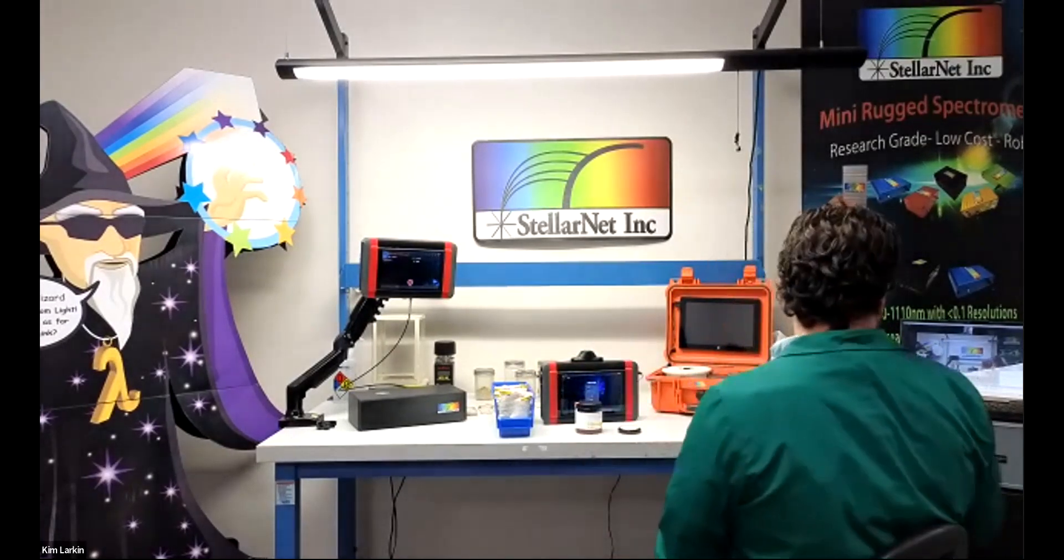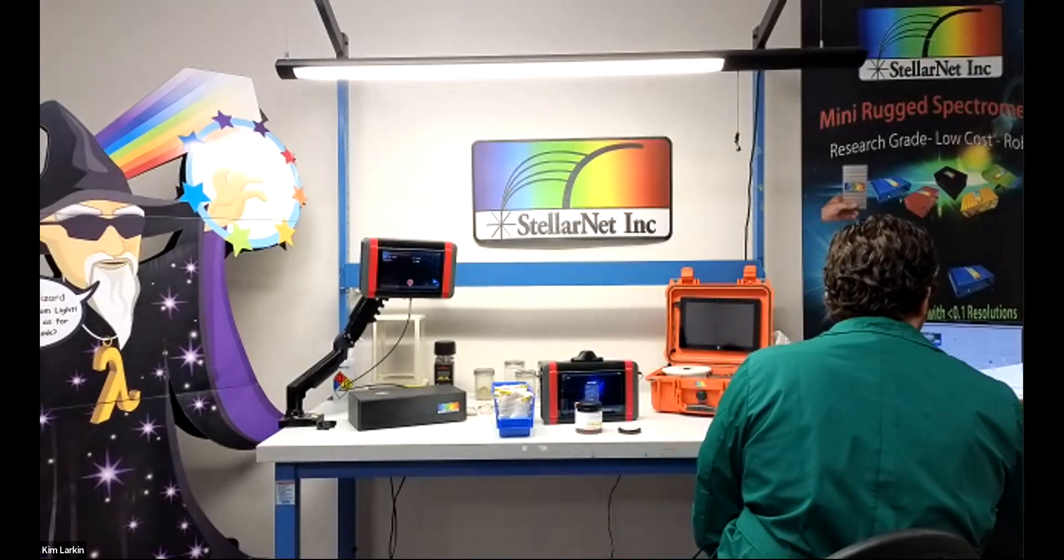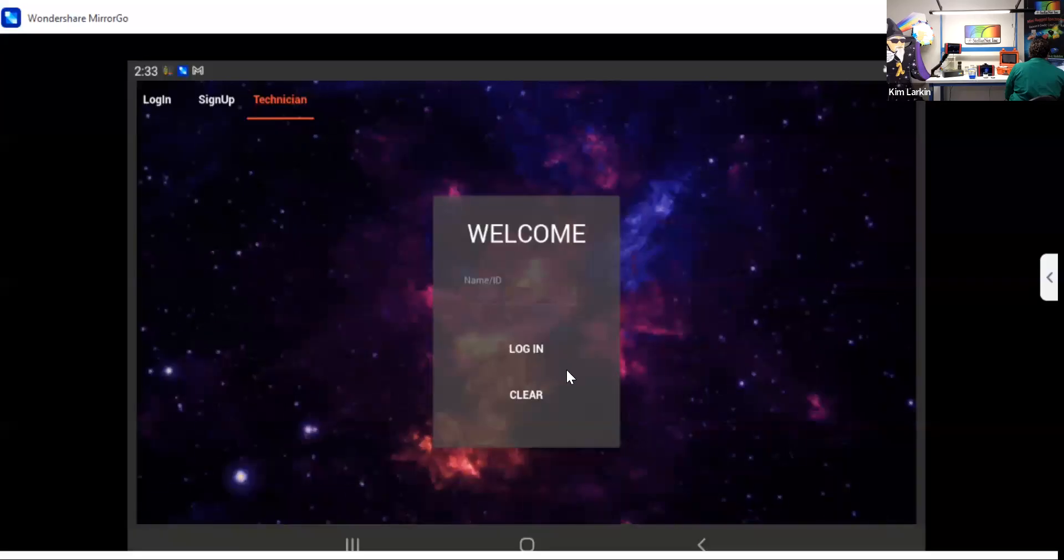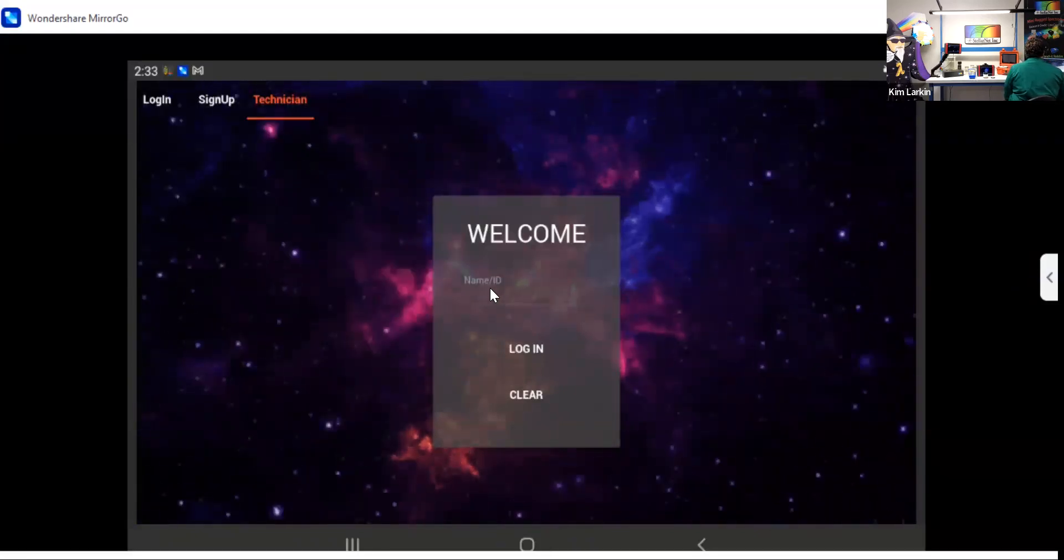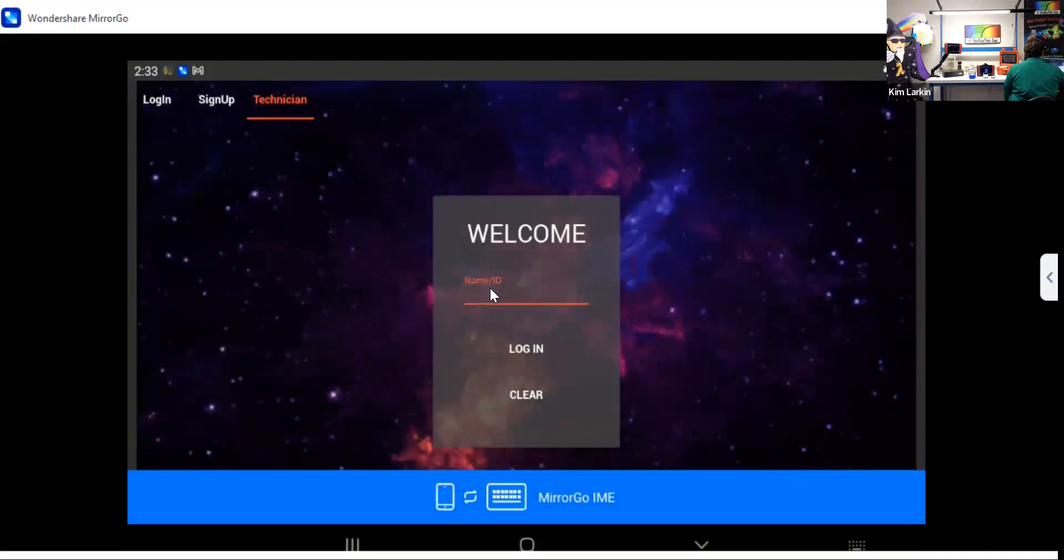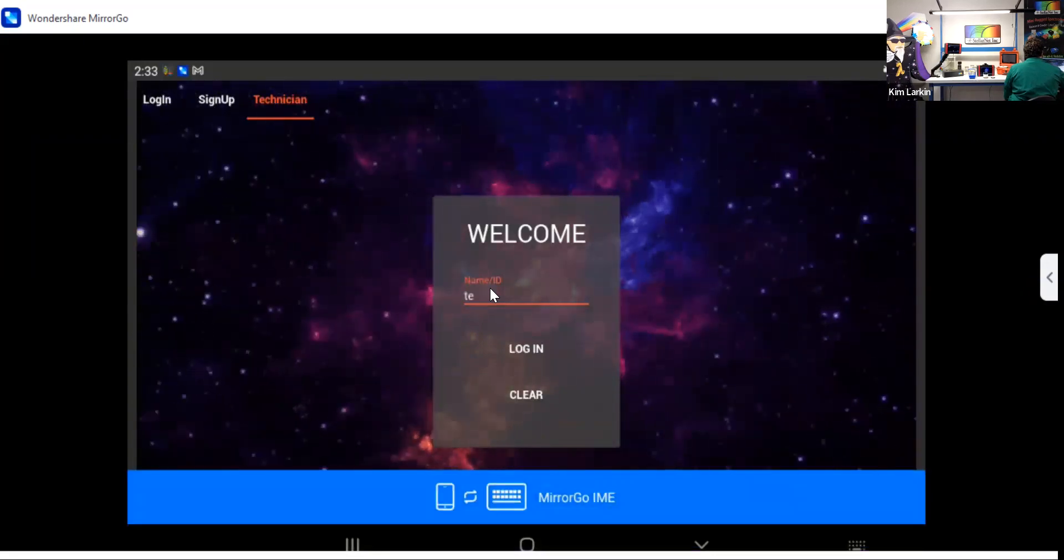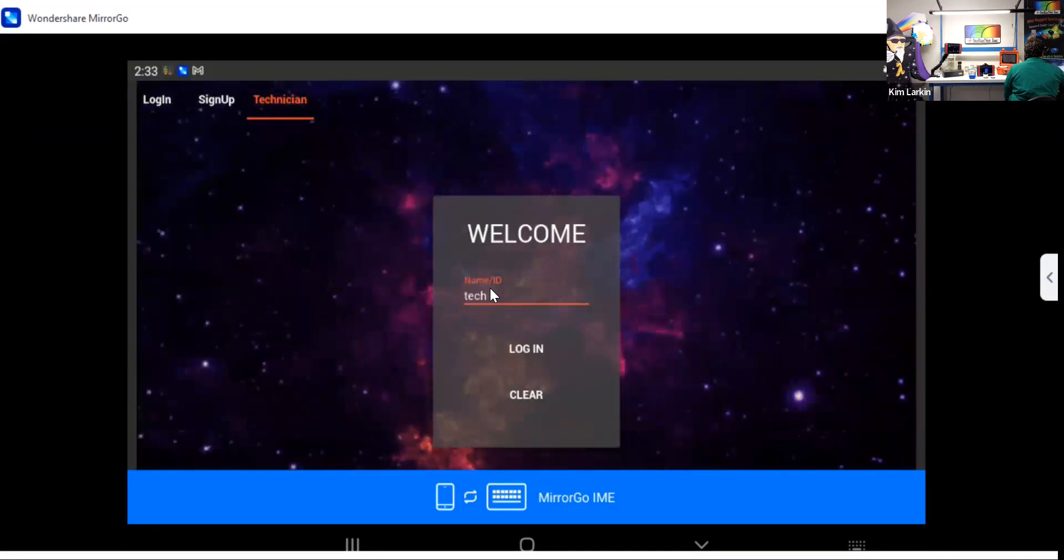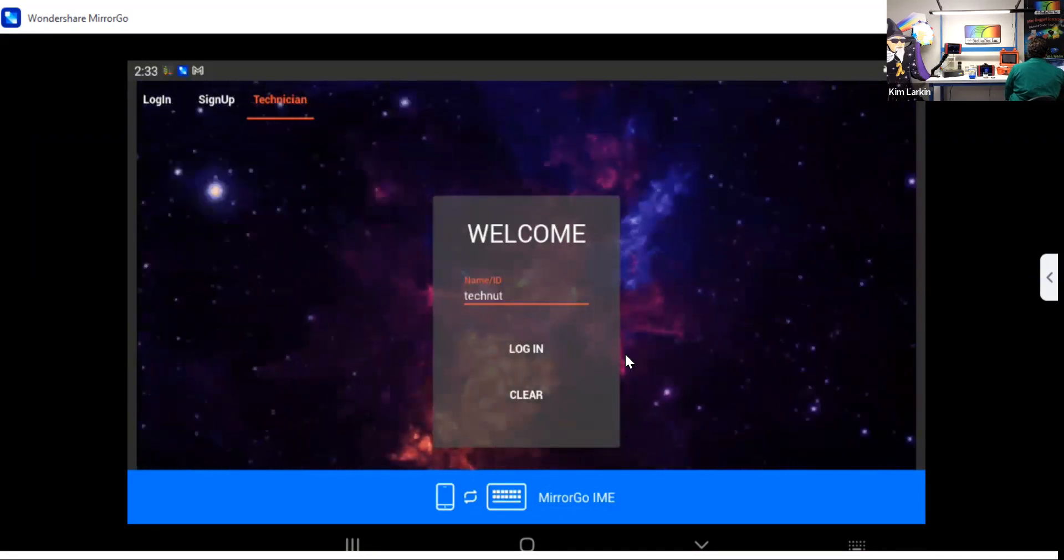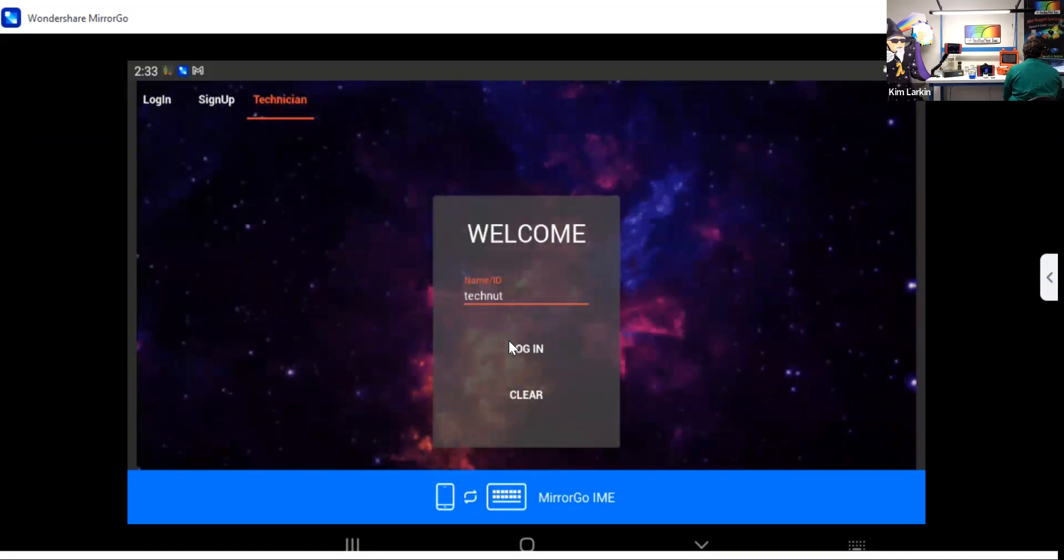So without further ado, I will share my screen with you. Okay. So now you can see this is the login screen for the ChemWiz ADK Pro software. I'm going to go ahead and write tech nut for nutraceutical and log in.